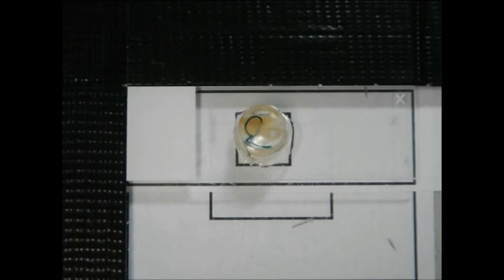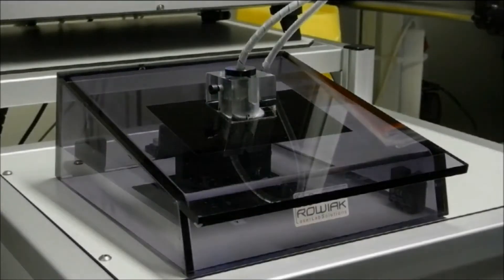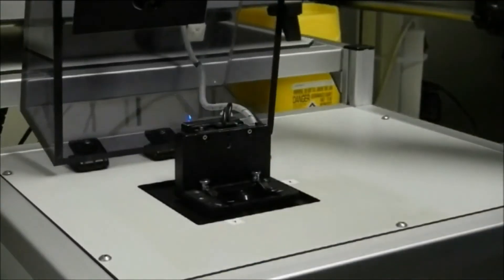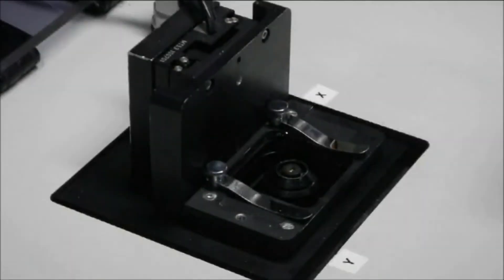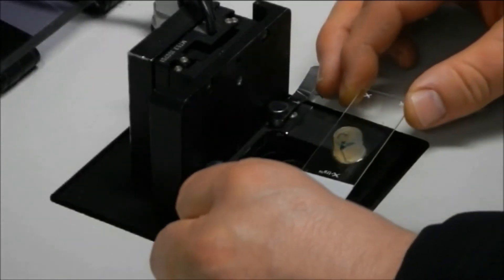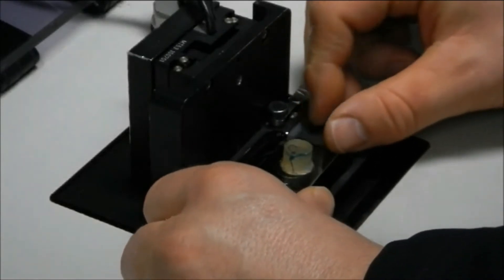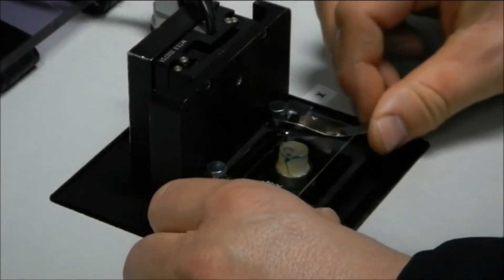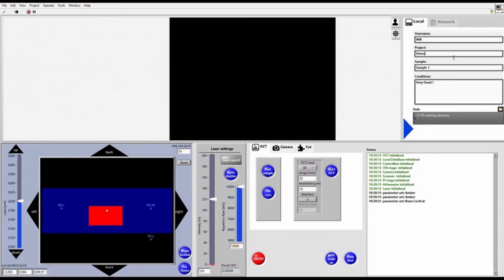Finally, the sample and the slide are placed on the microtome stage and held in place by two clips. After the entry of a few software settings, the cutting process has begun with a push of the start button.